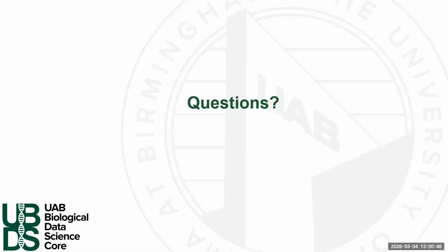Any other questions? Oh, Dev? Sorry, Arash? I was thinking about, you have different QC reports as HTML files from each step. Do you have any plans for exporting JSON or JSON-L files for agentic systems? Yeah, that's a good point. I figured out that you can just modify some parameters, but not necessarily change the whole toolkit. But if there's a loop with an entry point of some JSON-L files, the agent decides any changes in that parameter and then comes back with a specific input format.